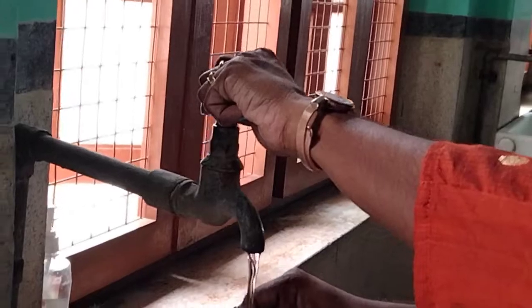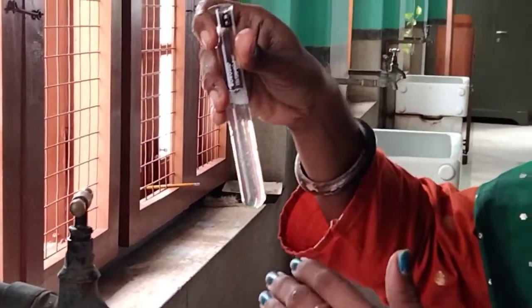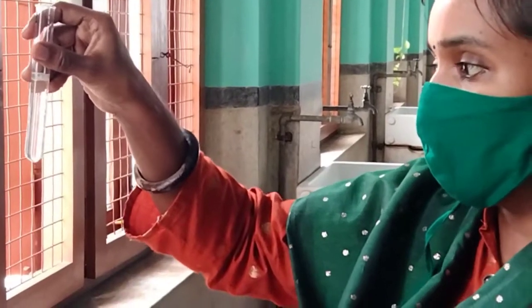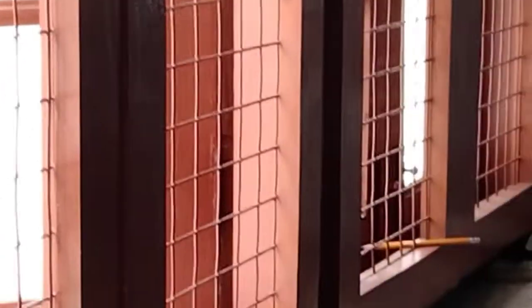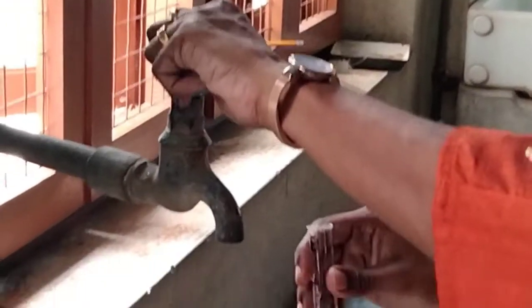Now again take water and wash it. Hold for a minute so that the scales will settle at the bottom. You can see the scales getting settled at the bottom — can you see the scales falling to the bottom? You can bring it closer to the camera. It is falling to the bottom, the scales. You can drain the water.